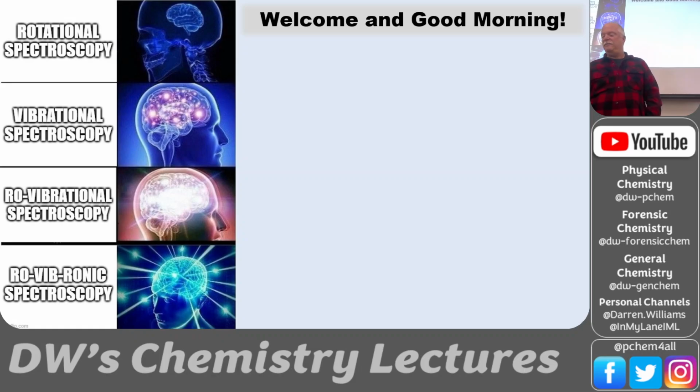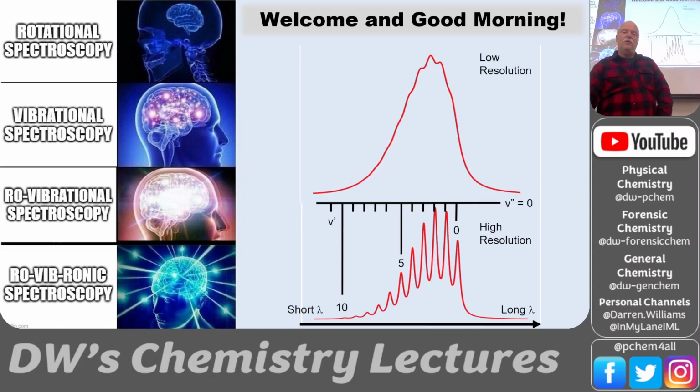It's a classic lab experiment that everybody does in PCHEM. Almost any legitimate school makes every student do this because it's the ultimate rovibronic. It's got rotational levels in it, it's got vibrational levels in it, and you're doing an electronic transition. So you see a jump in electronic. The electron cloud is changing. And so we're going to walk through that. It's what we see in the UV-vis.